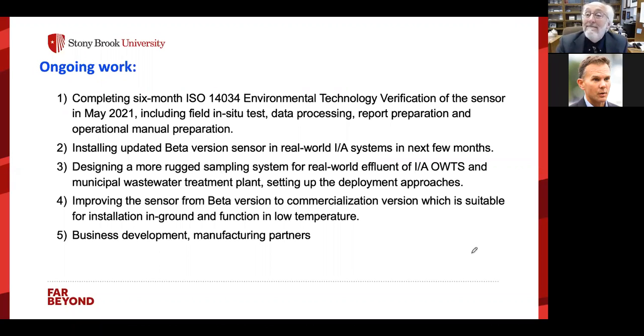Qing? Hi, Shep. Hi, I have a bunch of questions, but I'll start with one. Wastewater is a pretty complex matrix. You showed a calibration curve for lab samples. What does it look like if you do standard addition to an actual wastewater sample?